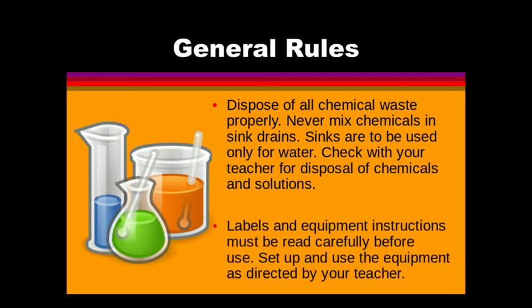Labels and equipment instructions must be read carefully before you use them. Set up and use equipment as directed by the teacher. So you should know how to use a triple beam balance. We'll go over it just to refresh your memory. You should know how to use a microscope. We'll go over it. You should know how to use a graduated cylinder. These are all things that you have done before.